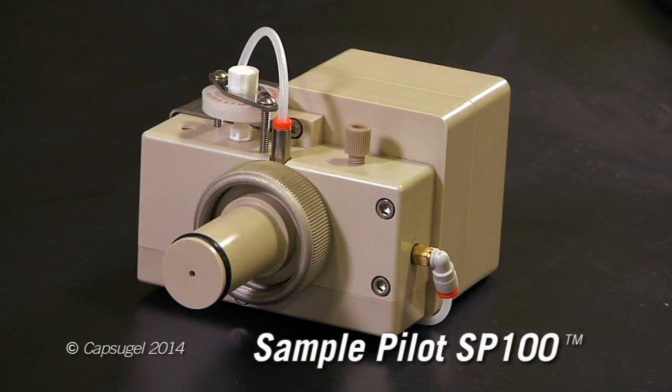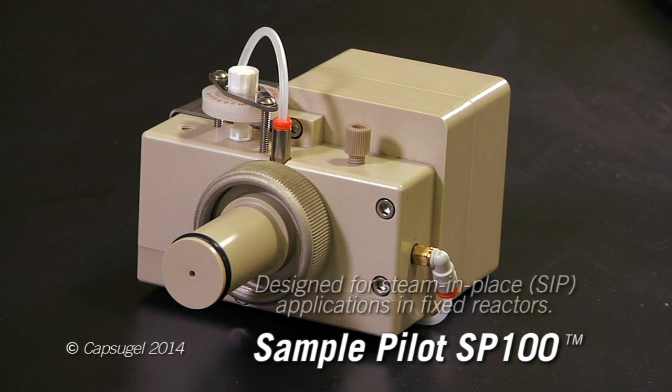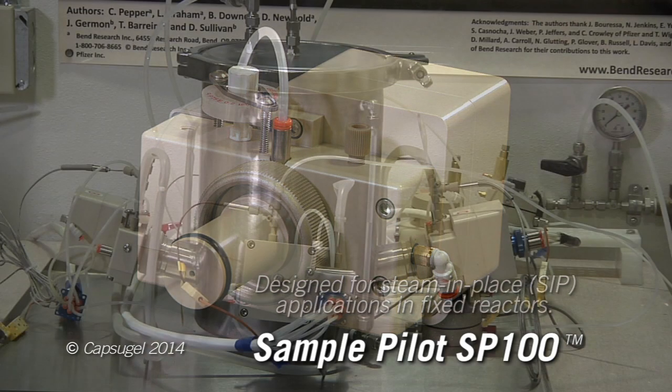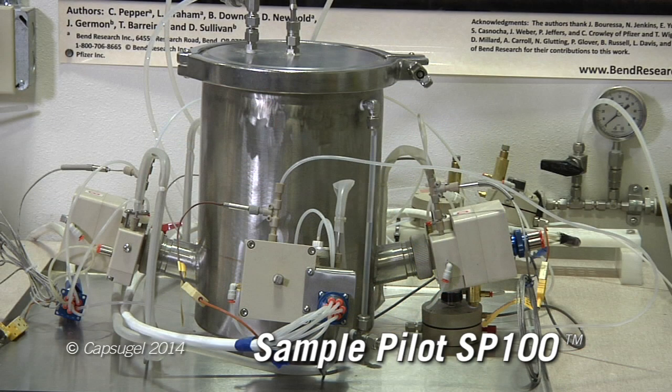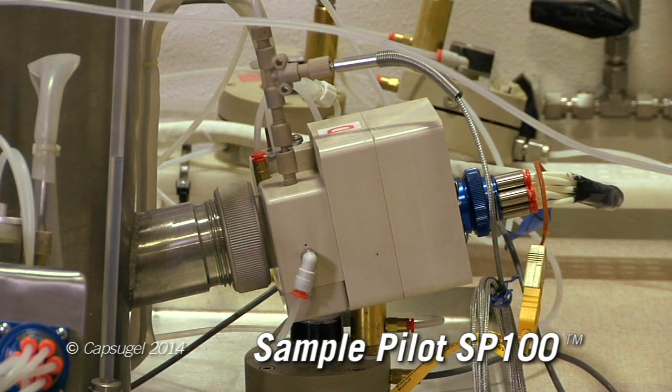The sample pilot SP100 was the original sampling system. It is designed for steam in place or SIP applications for stainless steel reactors. It can collect larger volume samples and has been proven in microbial and mammalian cell culture applications. After each sample, it is flushed with steam condensate.